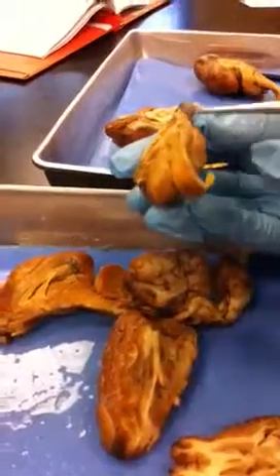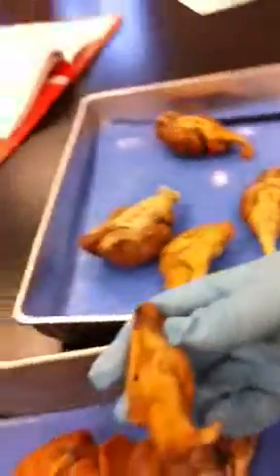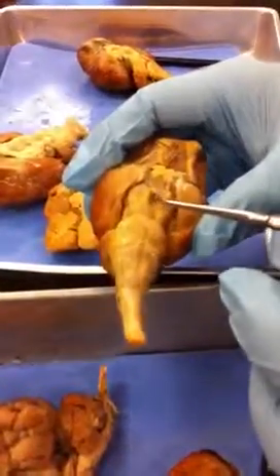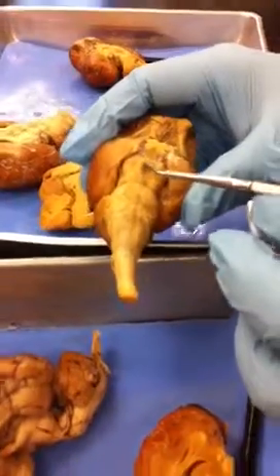So, what else? Optic chiasm. So we already kind of pointed the optic chiasm out, right? That's that intersection between the optic nerves. Mammillary body. Mammillary bodies can be a little tricky. There's one right there. There's a group of them right there. That's the mammillary body right there.